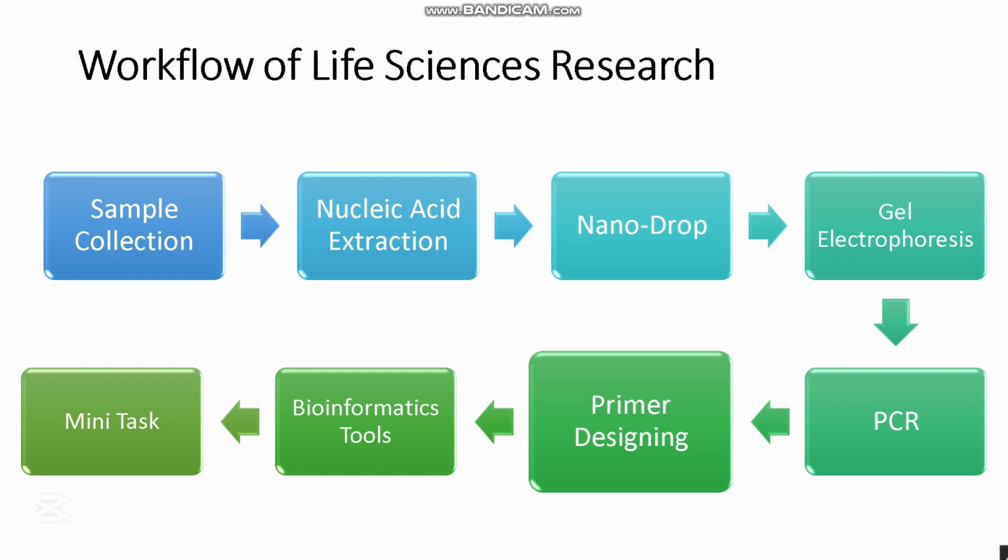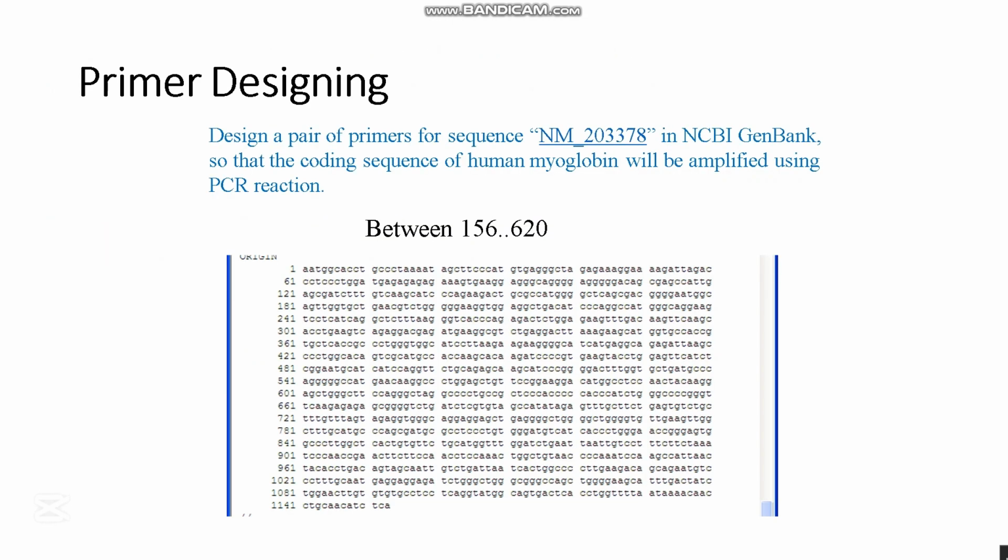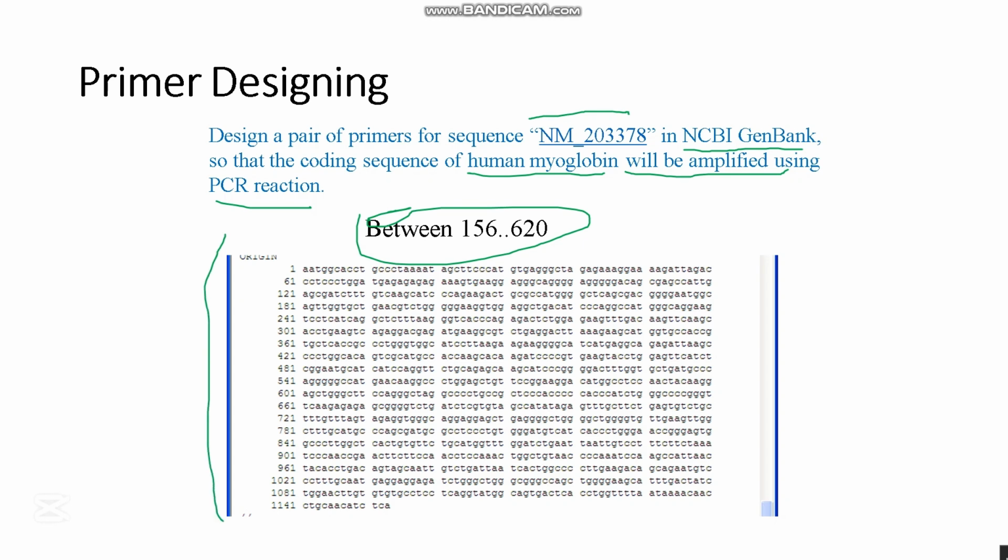Okay, now we dive into primer designing. First of all, we get the sequence, the sequence NM_203378 in NCBI GenBank, so that the coding sequence of human myoglobin will be amplified using the PCR reaction. Just copy that sequence.